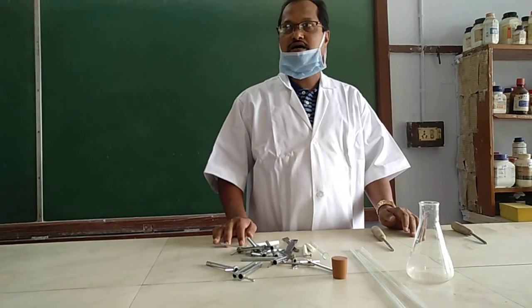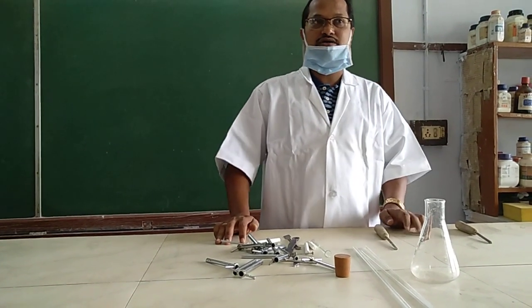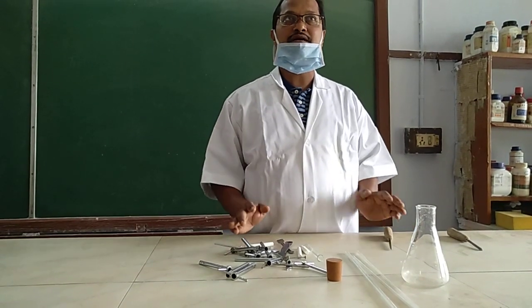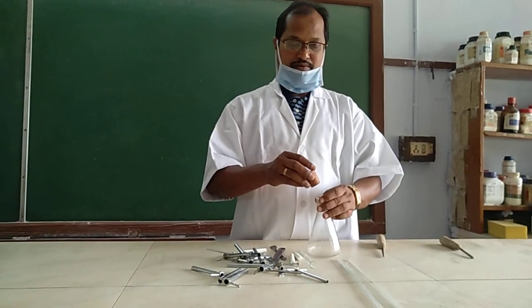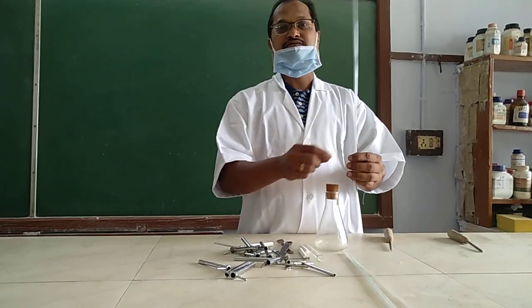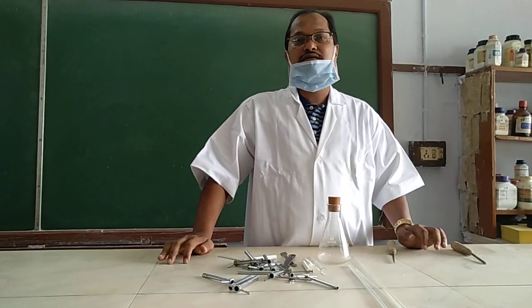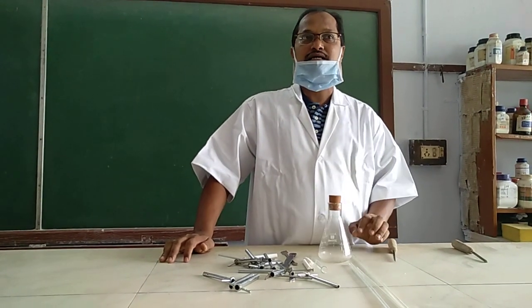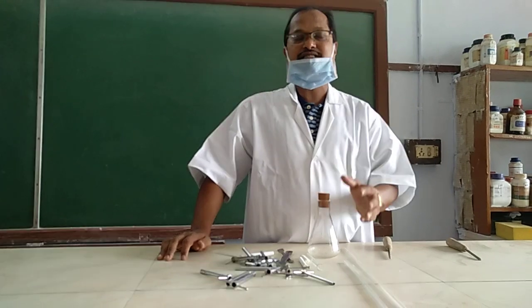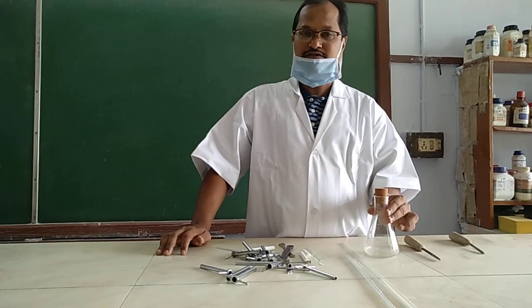Hello students, good morning. In this lockdown situation, we have planned to start your practical. Class 11, the first practical is fitting of a wash bottle. The requirement of a wash bottle is basically a conical flask or round bottom flask, a cork, and a streamline bent glass tube. It is used to wash various purposes and to pass a streamline of water to deliver for washing precipitates.